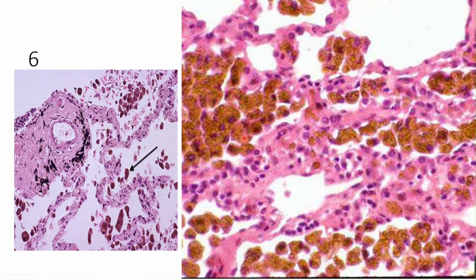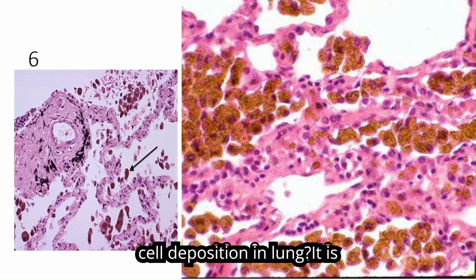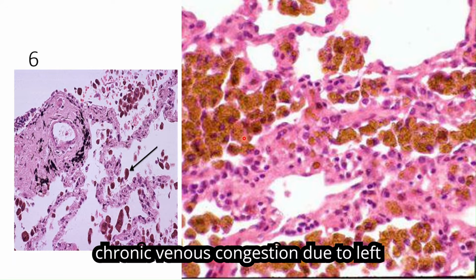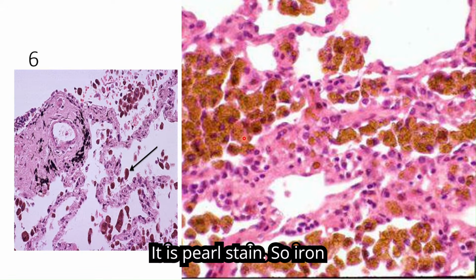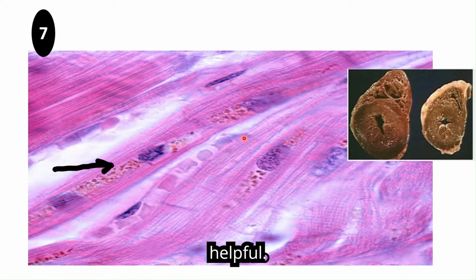So what is the cause for heart failure cell deposition in lung? It is chronic venous congestion due to left-sided heart failure. And what is the special stain for hemosiderin pigment? It is Perls stain. So it is an iron-containing pigment, so Perls stain will be helpful.